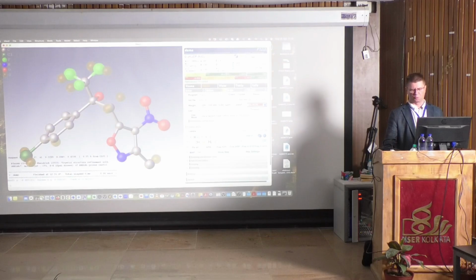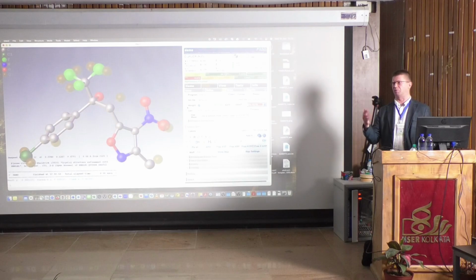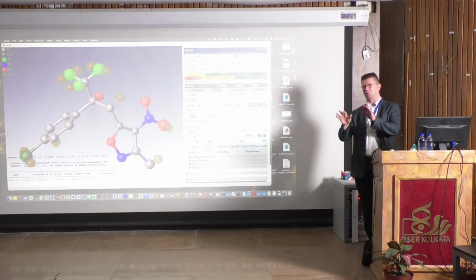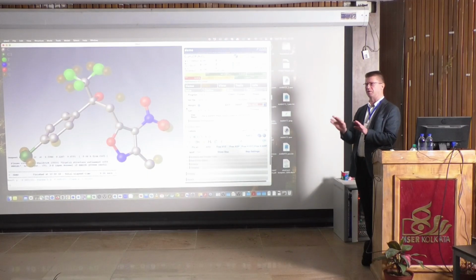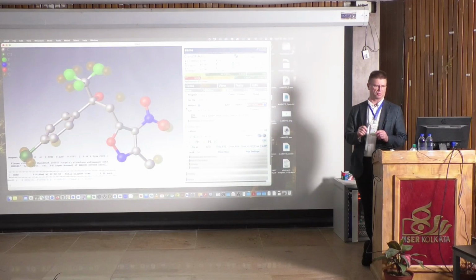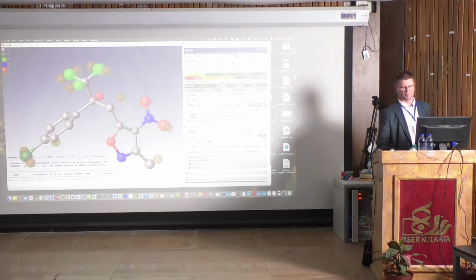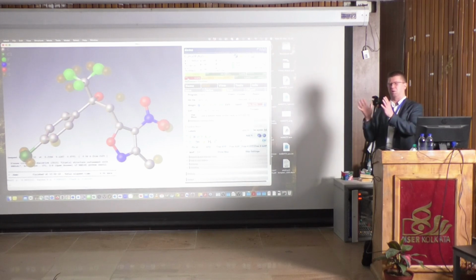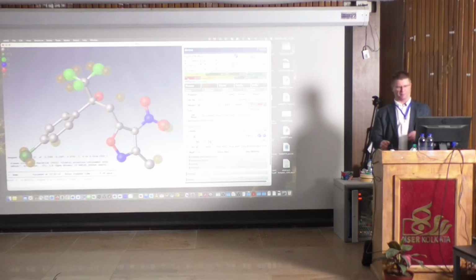You can see the weight is now red because I haven't clicked it. So I click it and we do this refinement. Now you can see that it's orange yet, but never mind, something is missing. So the weight has to be there because mathematically it will balance between the calculated and observed values. So we always have to do this, but that's easy to do. And you can see here a red tag, which is how much our model is moving from the data, and we have to get this red one to green.